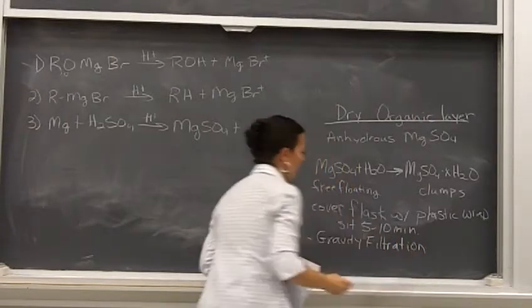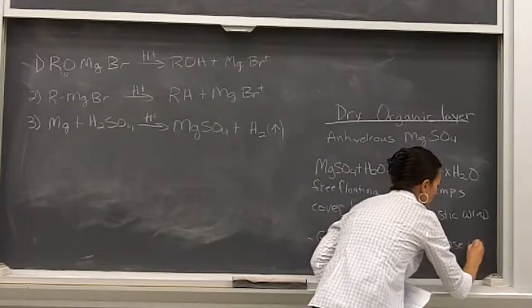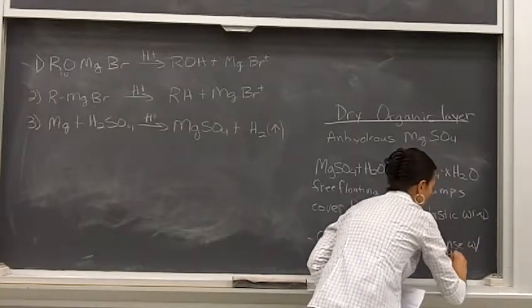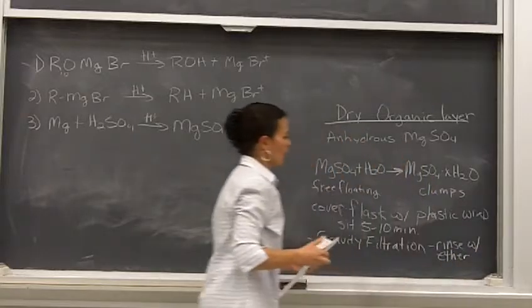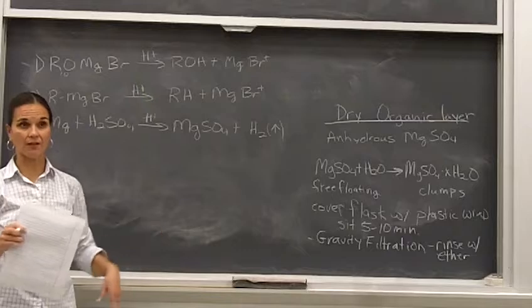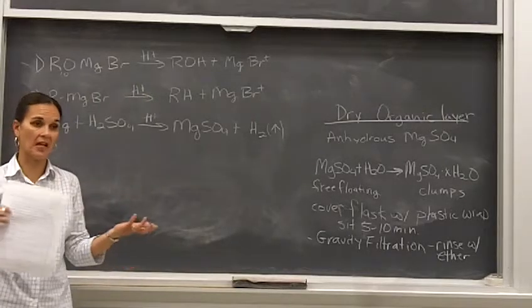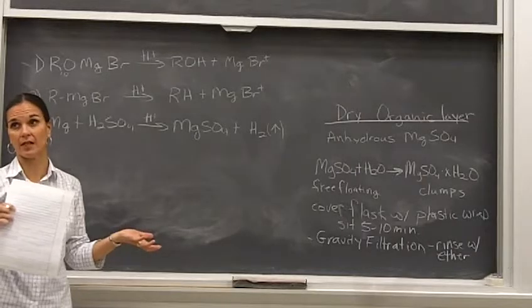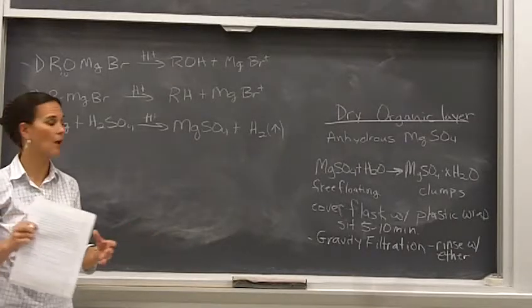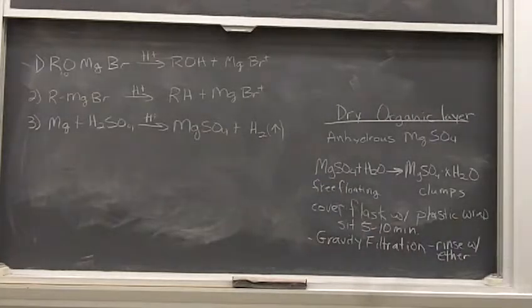Okay. And you can rinse it with some ether, rinse the solid. Okay. And then you're going to start distilling off that ether. If you use really hot tap water, that distillation, it's ether. It should take like 15-20 minutes to distill it. It shouldn't take very long at all, okay? You have to get to the distillation, okay? So you have to finish the distillation this week.